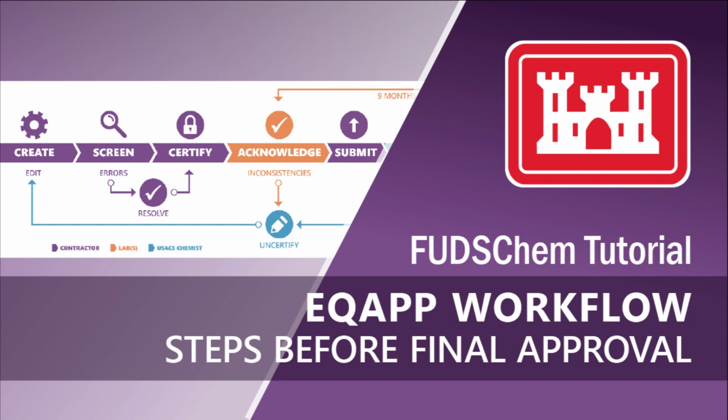This video will describe the steps that must be completed before an eQAPP can be approved. These steps are outlined in the eQAPP workflow diagram in Section 3 of the FUDSChem user manual. Considering these steps in advance will allow you to plan ahead for who will be in charge of each step, increasing the speed and efficiency of the process for your team.